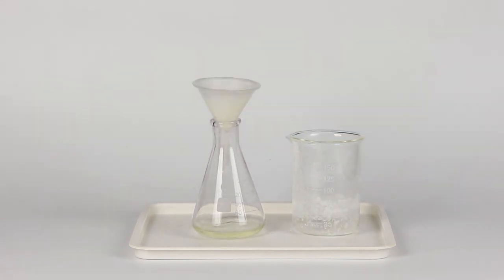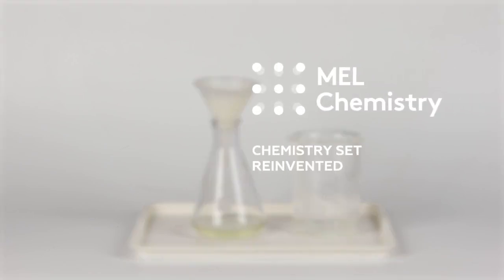The colorless liquid in the flask is whey, while the white mass left in the filter is curd. Learn more about this experiment on our MELScience website.